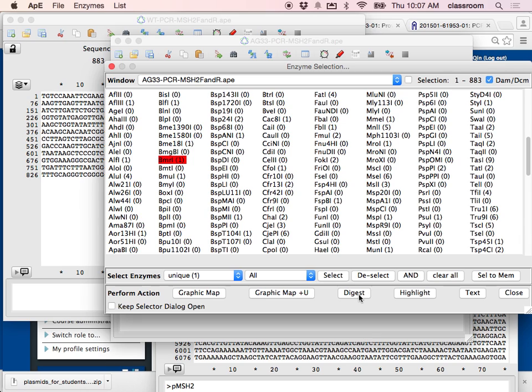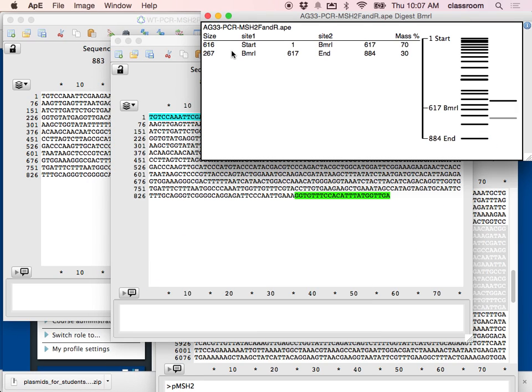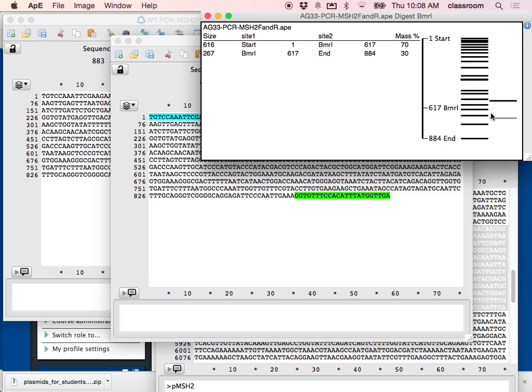Running a digest on the mutant — the ptplot shows BMR1 cuts at position 617. I will see two bands: one band of 267 base pairs and another band of about 616 base pairs on the gel. On the agarose gel we should see two bands: 267 bp and 616 bp. That's how we use a restriction enzyme to distinguish a mutant from the wild type.